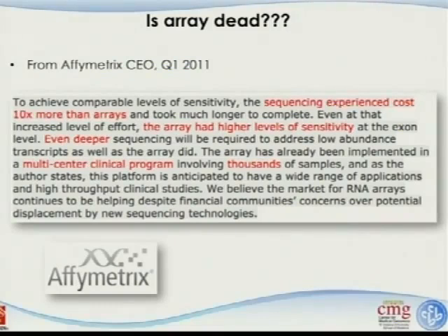And as the author states, this author refers to a paper that published comparing the performance of two technologies. This platform is anticipated to have a wide range of applications in high throughput clinical studies. We believe array is still alive. So that's basically what they are saying.